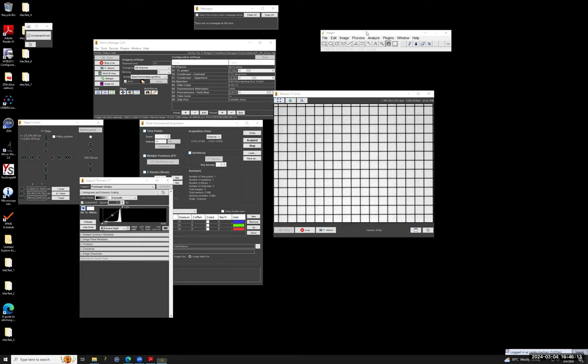And then I can call this macro, which first asks whether the splitting is horizontal or vertical, so whether the two image channels are the left and right halves or the top and bottom halves of the camera. And then there are settings of the regions. In the practical case with a splitter, I would typically want the shift to be half of the size of the camera, and by aligning the splitter, I maximize the correlation. Of course, in this case, it's not possible, so the correlation will depend on how well I set the shift to match the periodicity of the grid.